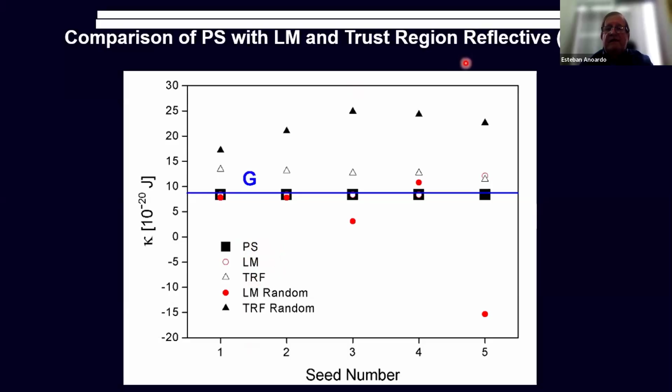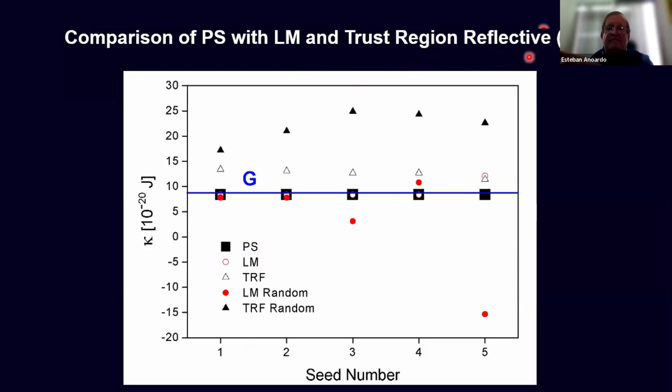What is this? Well, this is a modification of Levenberg-Marquardt in order to add a box constraint for a parameter. You know that Levenberg-Marquardt has no restriction on the range of the parameter. You can put a range if you want, but the method does not need it. But if you want to add the box, then you have a version that considers it.